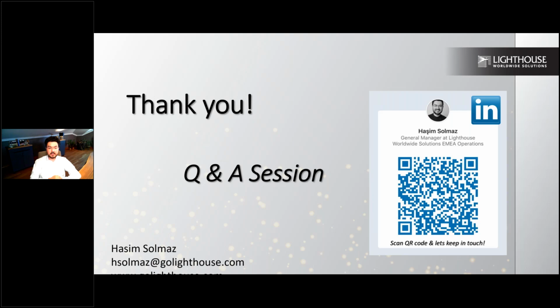But as you said, we're expecting it to be a scientific calculation based on statistical methods. Your statistical method can give you less than 1, larger than 0, as per your calculation. So if you are taking a lot of locations into consideration, or one location throughout the trends, your number would be between 0 and 1. That's why less than 1 doesn't always mean 0. This could be a value of a statistical calculation.